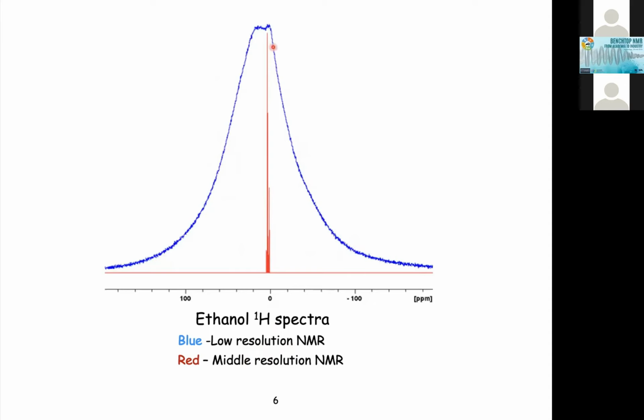And this shape here doesn't depend on the T2 of the sample. It's always controlled by magnetic field inhomogeneity. If I put water, another solution, ethanol, or any other material in solution or in liquid state, it will give you exactly this shape, okay? Because the decay of the signal is dependent on the magnetic field inhomogeneity.